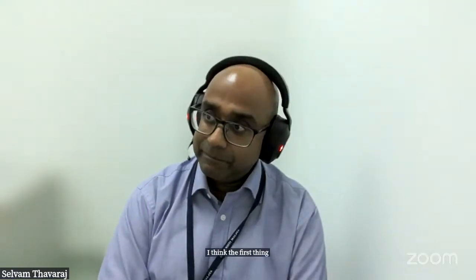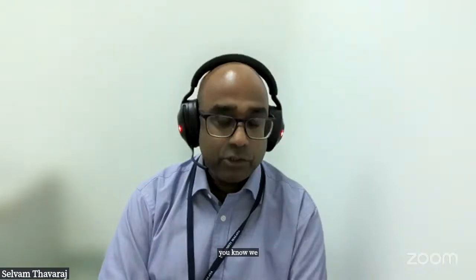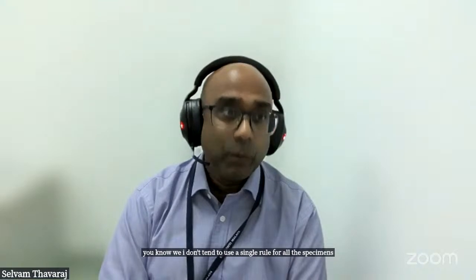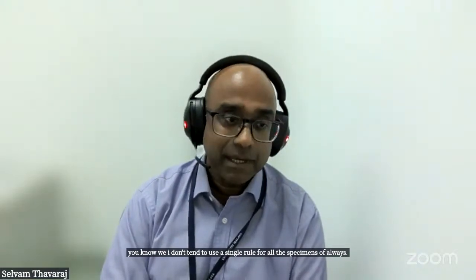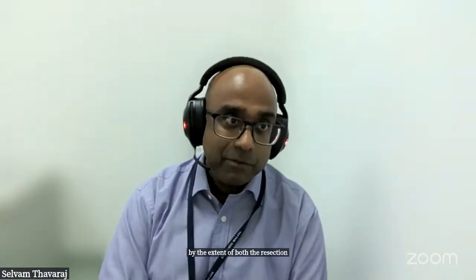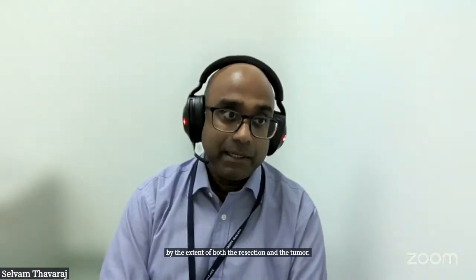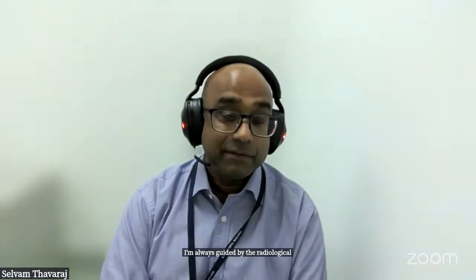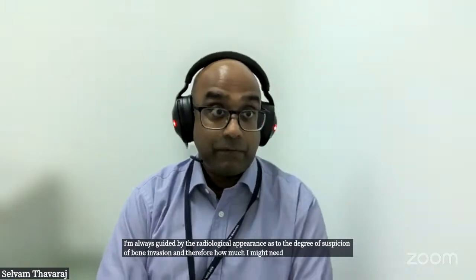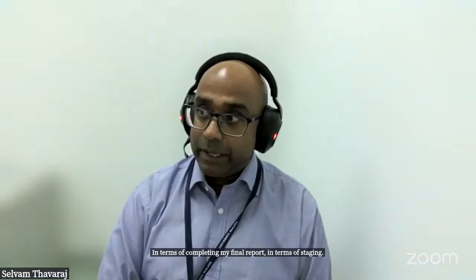Thanks, Adam, for that. That's very, very helpful. The first thing I'd like to say is that I don't tend to use a single rule for all specimens. I'm always guided by the extent of both the resection and the tumor. I'm always guided by the radiological appearance as to the degree of suspicion of bone invasion, and therefore how much I might need in terms of completing my final report in terms of staging.